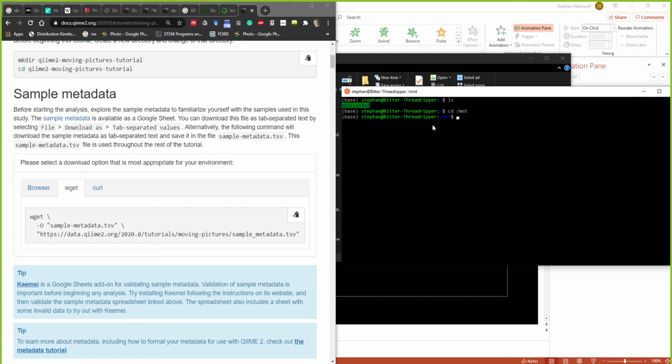So just see if you can cd to mount, and from there you can type ls again, and now I see all my different drives. So now I can cd to c, change directory, cd /mnt/. Or you can just do cd mnt and then step by step go up. Like I'm doing on my screen, you see I did cd to the mount. Then I saw all the drives that are there.